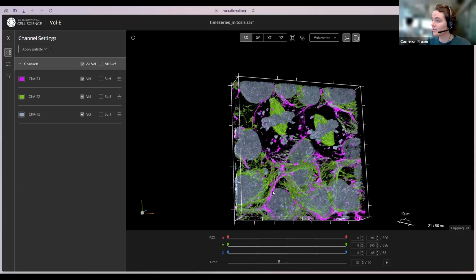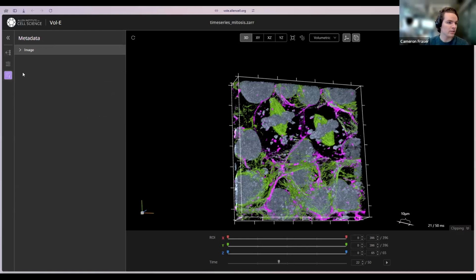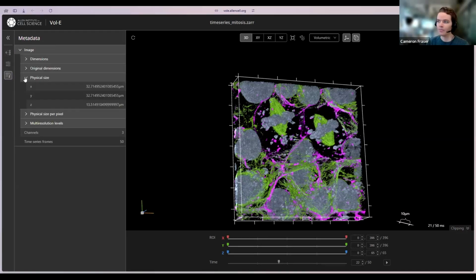We also want to set it up so that you can make a selection and open the whole thing in Volley with options to navigate between those images as different scenes, and as well to drop any additional metadata that BFF might know about into this metadata viewer over here, which I didn't show off before, but we can accept arbitrary metadata in addition to what is already provided by the OME standard.